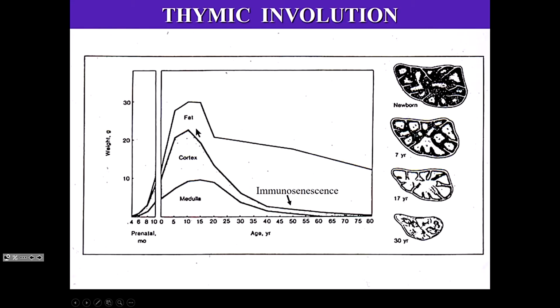So this just, again, highlights the fact that as a person gets older, the components of the immune system undergo immunosenescence. We've seen that in bone marrow, where the red marrow is replaced with yellow marrow, right? We've seen that in the appendix, where the younger person had quite an abundance of lymphocytes, and the person, I think 36 years old, had very few T cells. Now we see it in the thymus, where again, much of the T cell component is now replaced by adipose tissue. So this is a general theme that occurs throughout life.